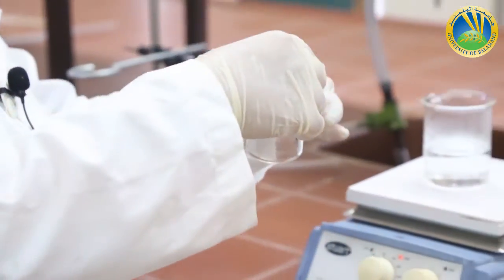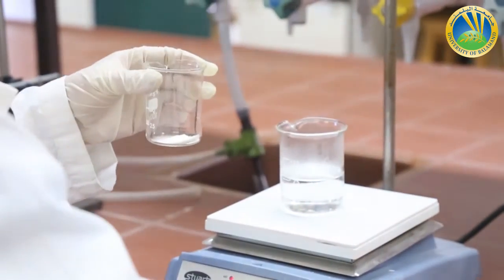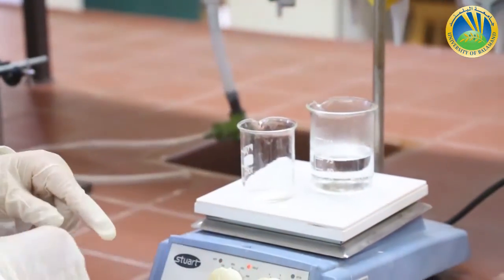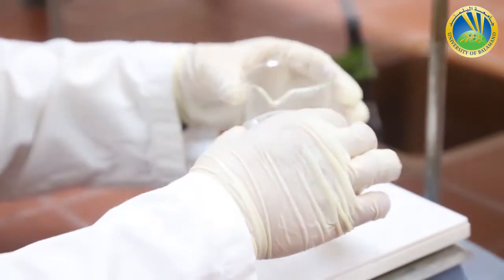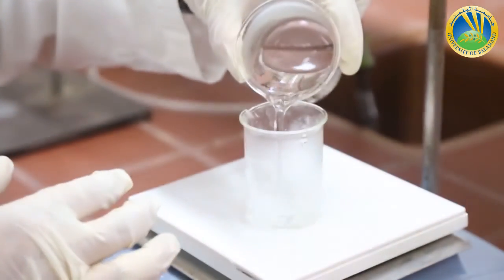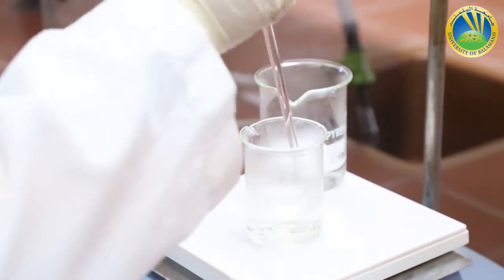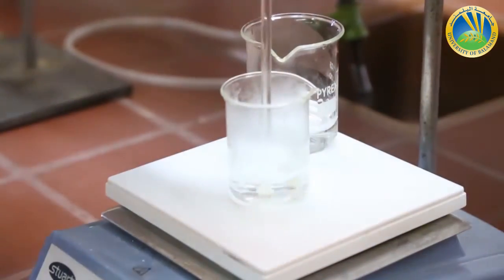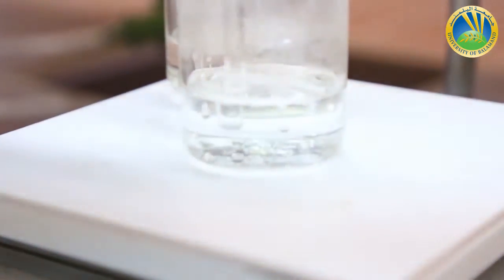I have to put them in a glass beaker and to dissolve them with the little amount of hot boiling water. We have to add the minimum amount of water to let acetanilide dissolve completely when the water boils. As you see, there is some amount of insoluble impurity.